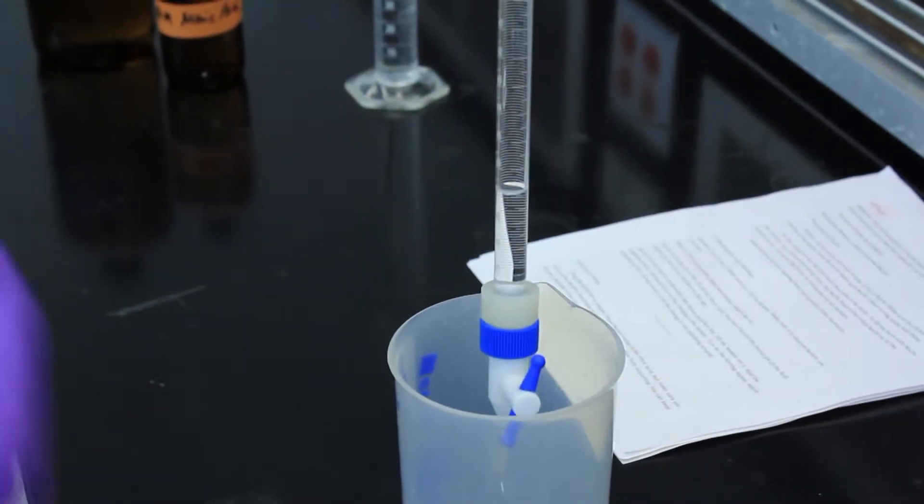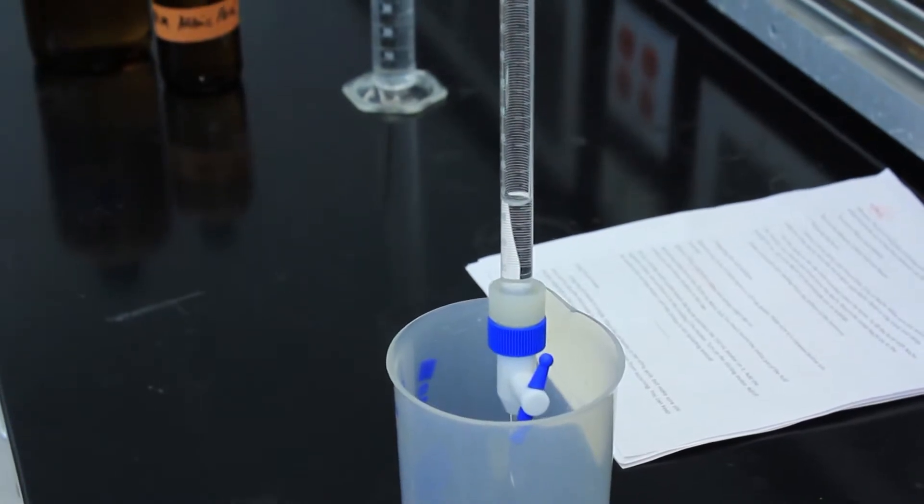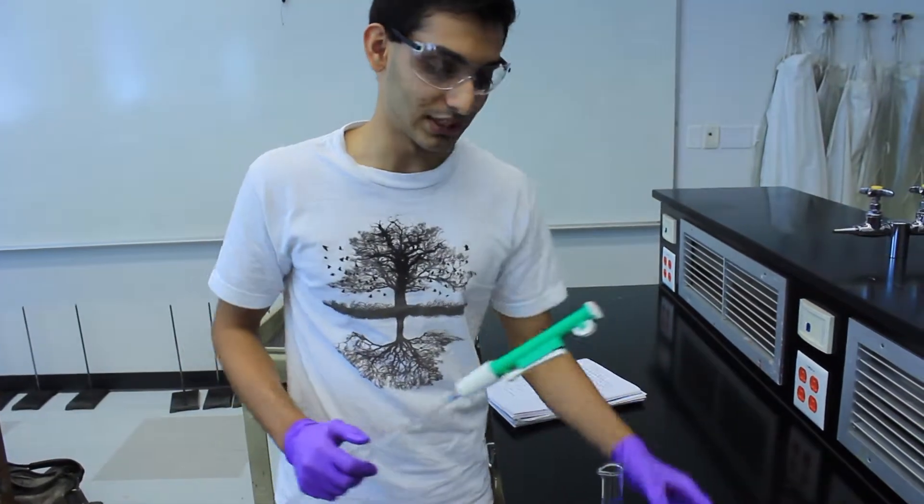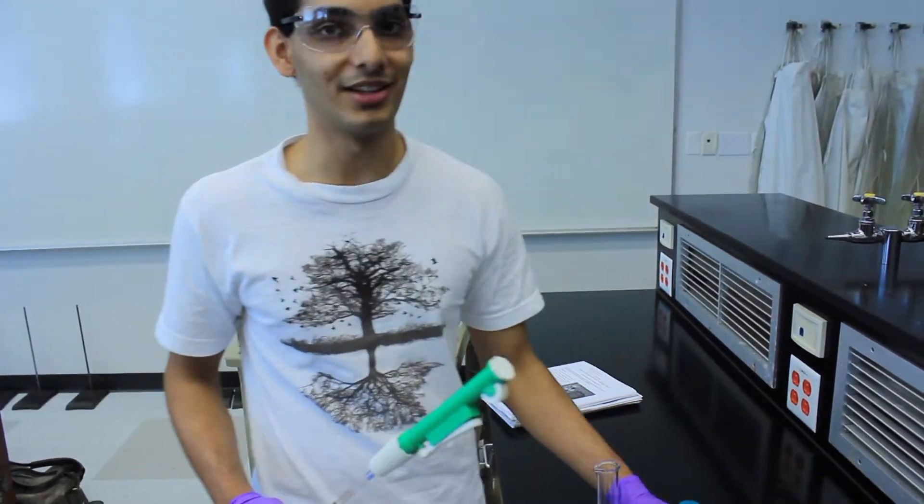Go ahead and rinse it with sodium hydroxide again just to make sure it's standardized. Use a volumetric pipette and a pipette pump to extract 25 milliliters of nitric acid.